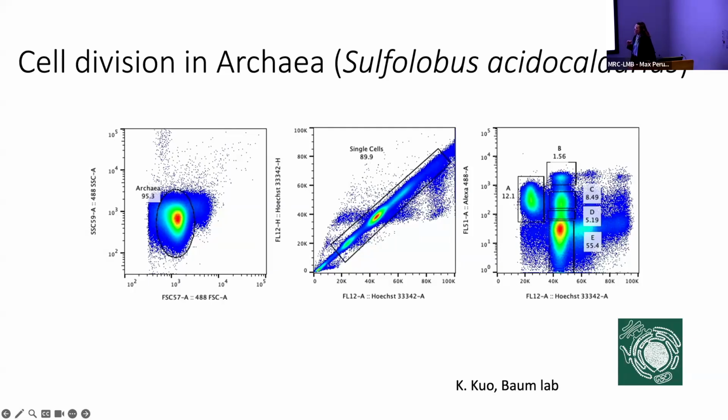So we need to make sure that we're able to identify them within the resolution limits of the sorter. But also, we need to ensure that our alignment of the machine is very, very tight. The alignment of the lasers to ensure that we're getting very tight cell cycle peaks, and that we're able to subsequently sort the different populations throughout the cell cycle in a very purified manner. And that's been ongoing for some time in the facility.